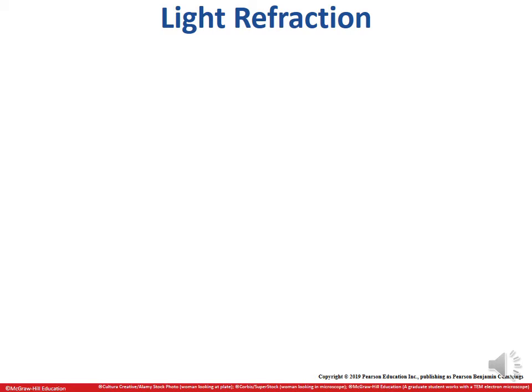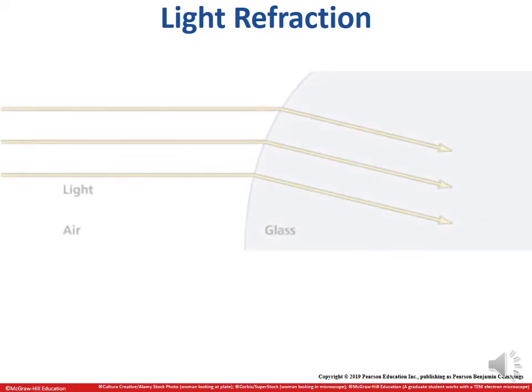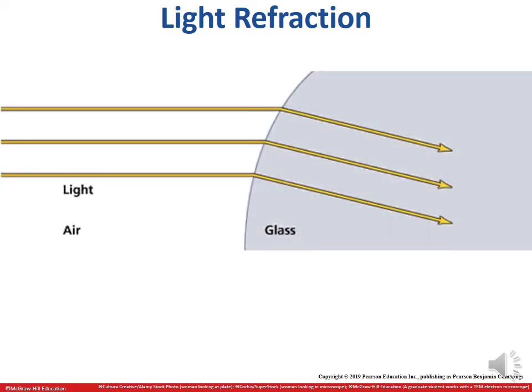So when we're using visible light, we have to consider refraction of that light. When light is traveling through air, it's going to be traveling without much hindrance, but as soon as it hits something with a different density, like the glass of the lenses, it's going to refract or bend. And so we use this to our advantage. If we understand light refraction, we can place those lenses at the right distance and the right shape and force that image to where it can be viewed.